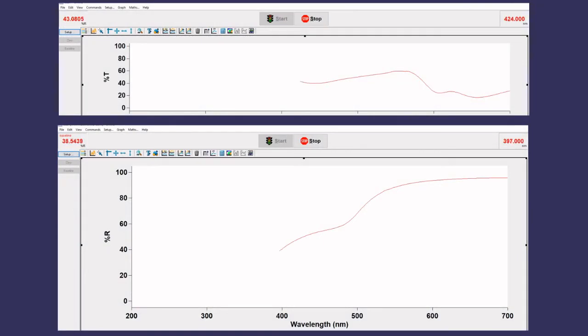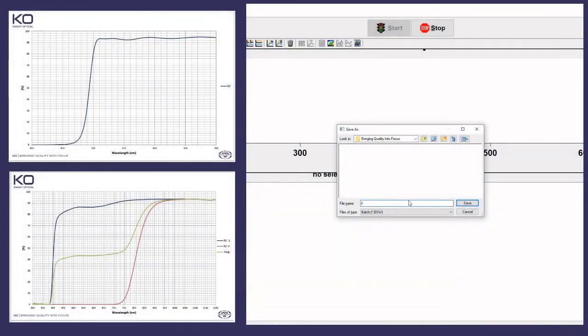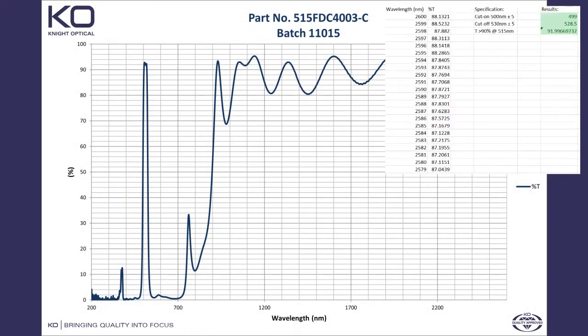The software displays a live graph of reflection percentage by wavelength. The collected data is presented in a graph with all relevant information linking it to the specific part. This enables easily accessible results and traceability as part of our excellent quality control here at Knight Optical.